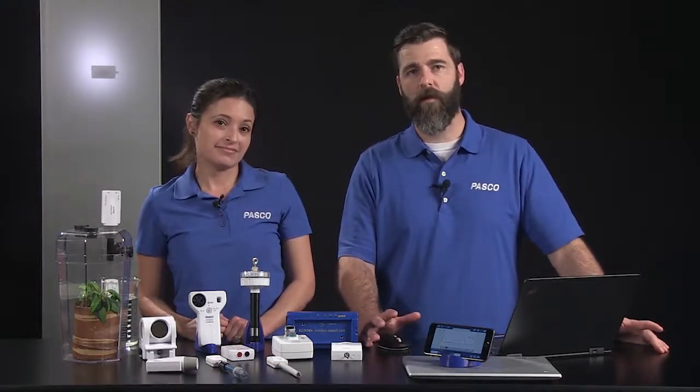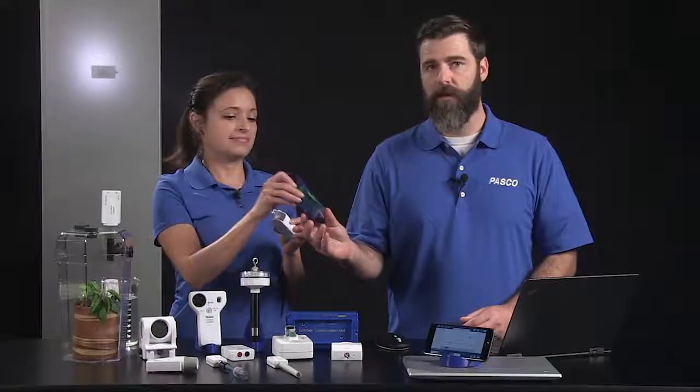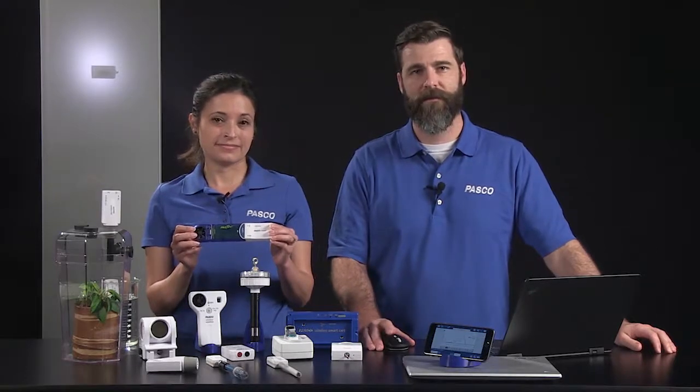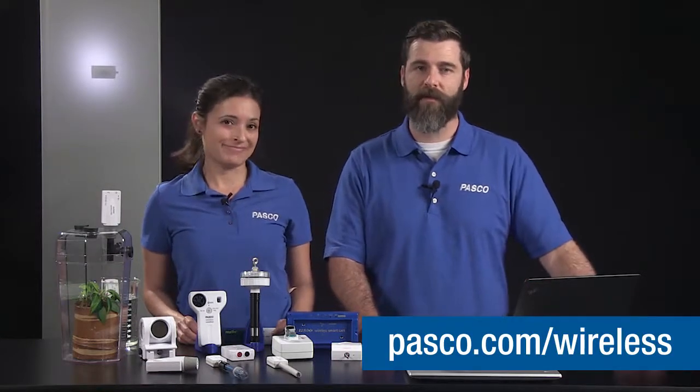We've covered the basic features of our wireless sensors. If you have older Passport sensors, you can connect them wirelessly with the AirLink interface. You can plug Passport sensors into the AirLink interface and connect them to SparkView the same way you connect any other wireless sensor. If you'd like to learn more about our growing line of wireless sensors, please visit pasco.com/wireless.